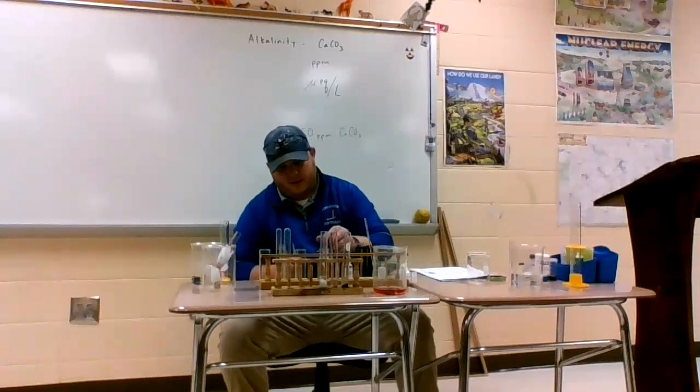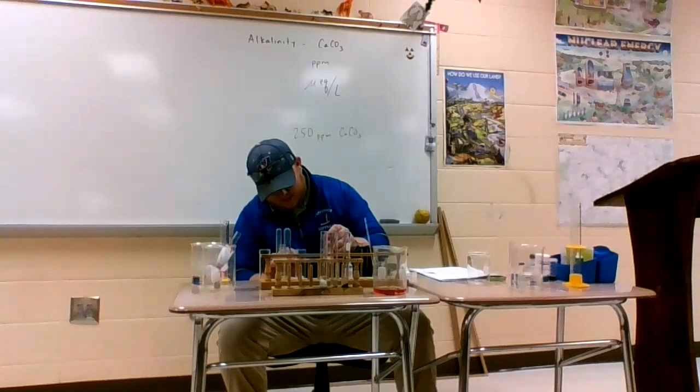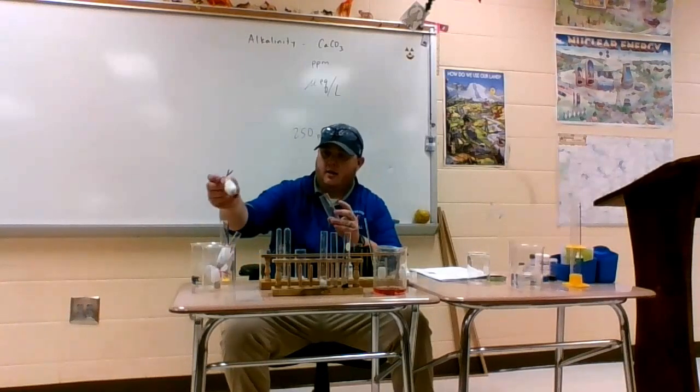Let's see. Isn't it, if you do that, making it not whole? Well, I'm just gonna have to use some of this and give an indicator. Do like one drop?